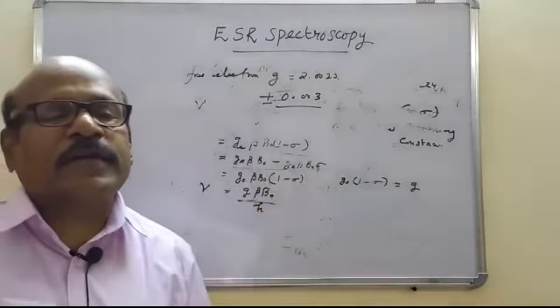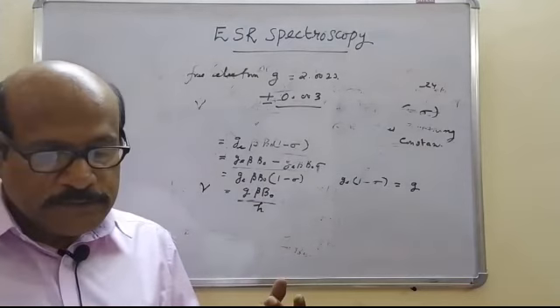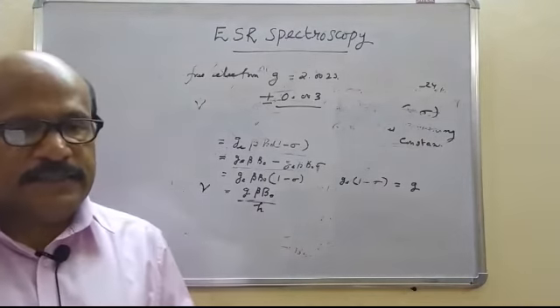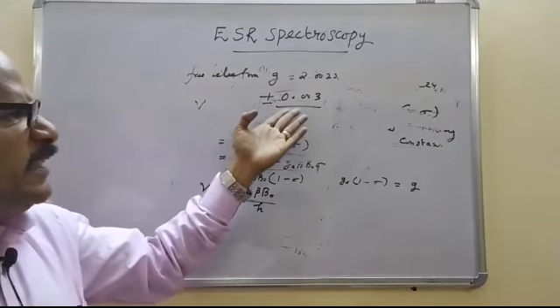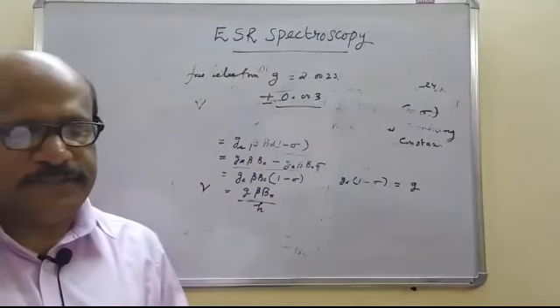There is a kind of overlapping. Okay, so when we take the absorption spectrum, the difficulty is that there is a kind of overlapping, so the calculation is found to be difficult.